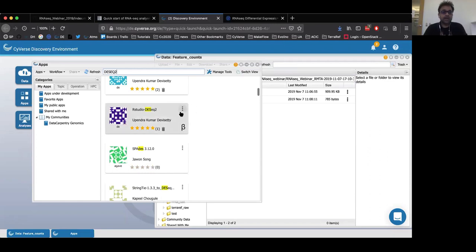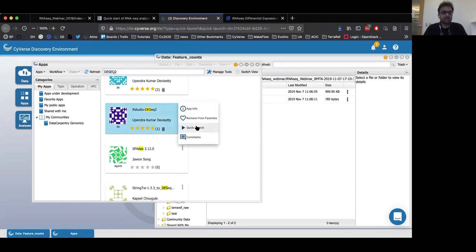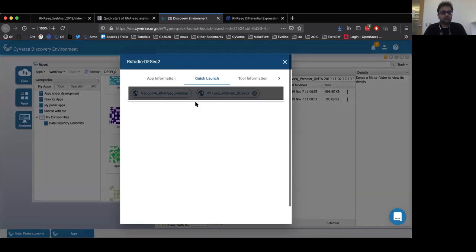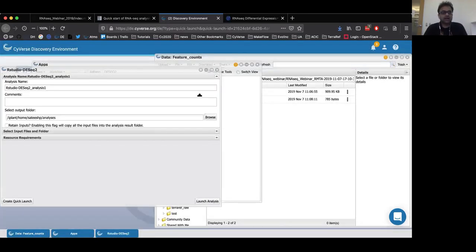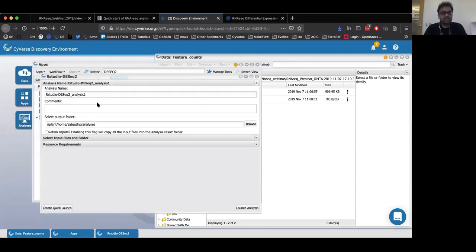To use the quick launch button and have the R script preloaded into the app, navigate to the app and click on the three buttons in the top right corner. It will bring up a small menu where you can select quick launch. We will be using the RNA-seq webinar DESeq2 launch. Once you click that, you will be given an option to click a play button that says 'use this quick launch.' Clicking that will open the RStudio DESeq2 app. Again, we can give an analysis name here or leave it as defaults.